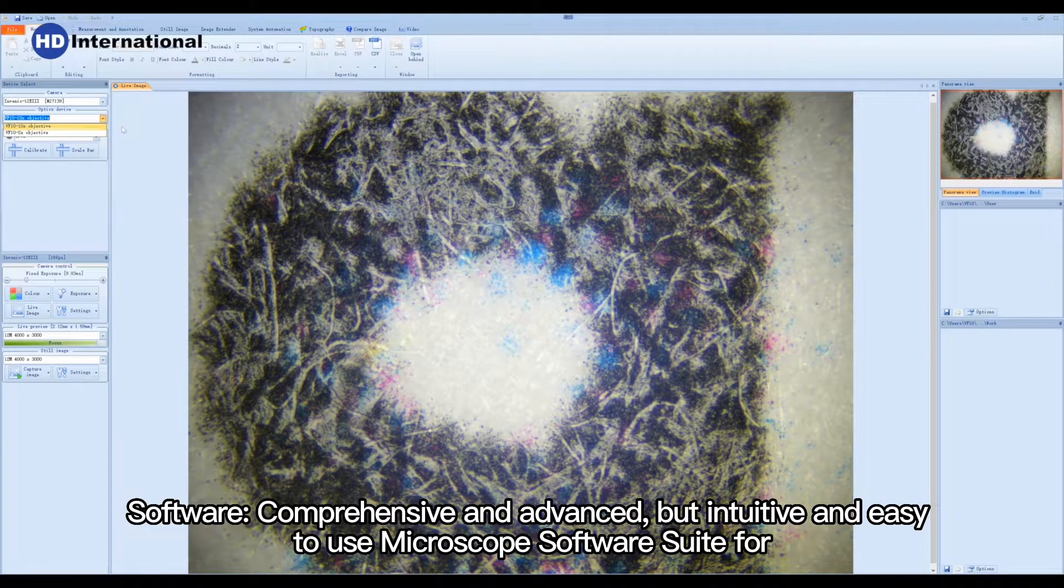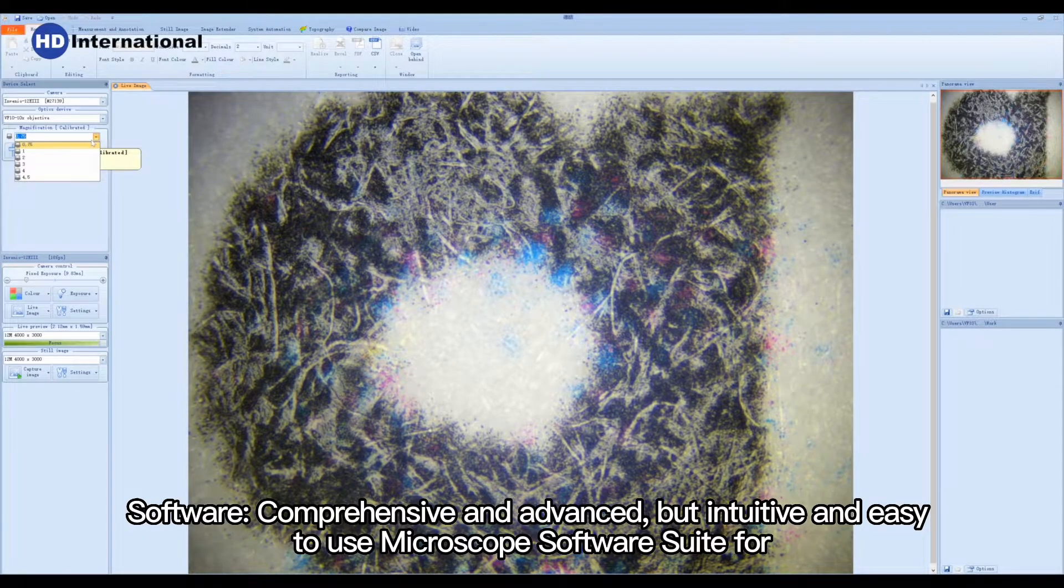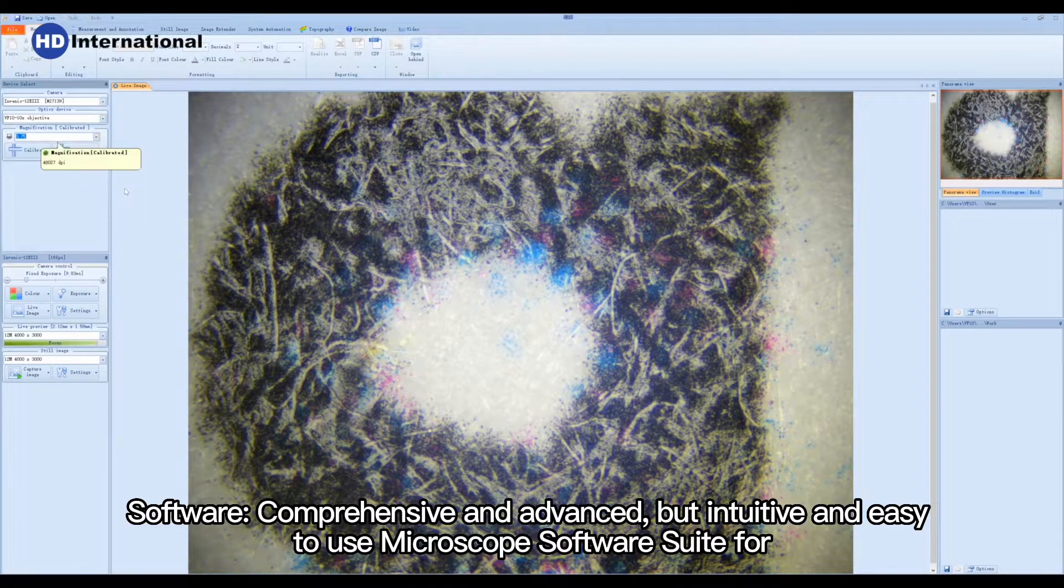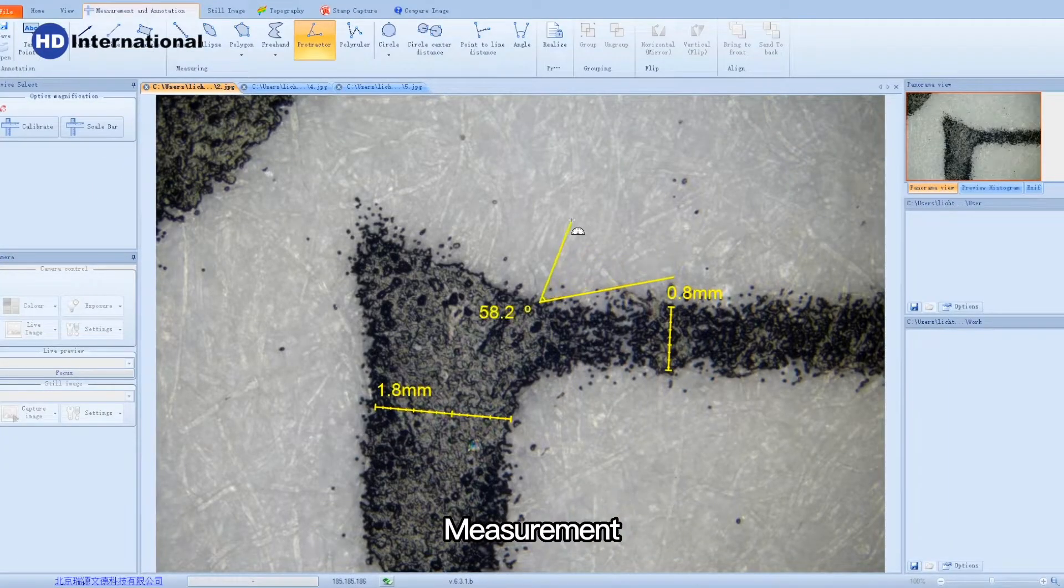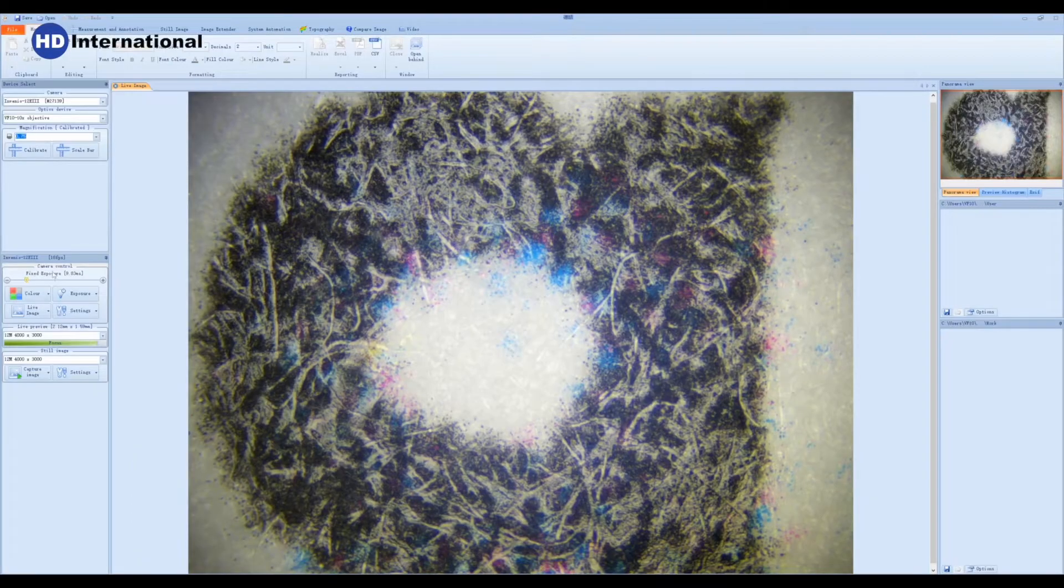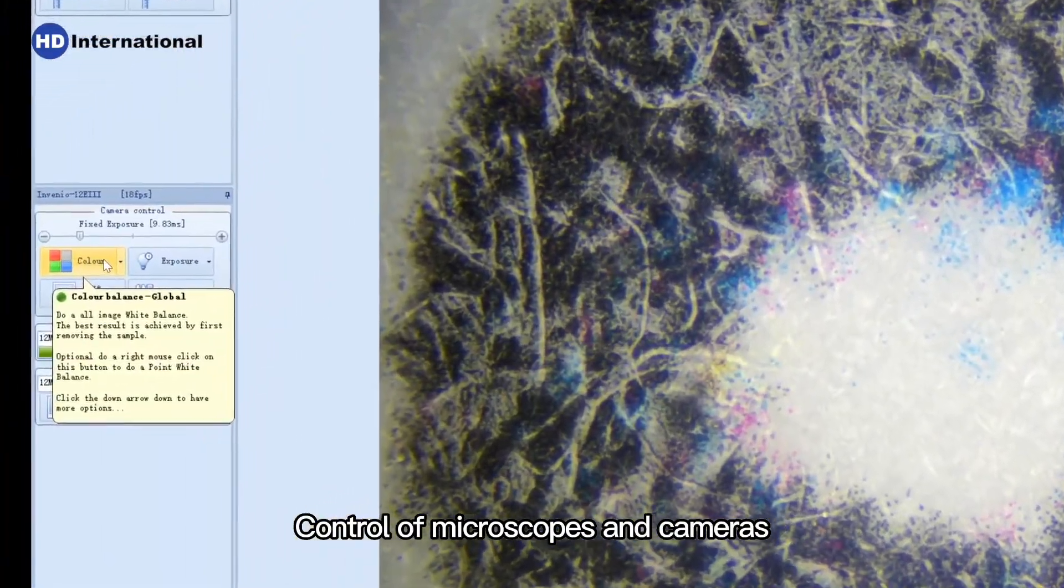The software is comprehensive and advanced, but intuitive and easy to use. The microscope software suite provides measurement capabilities and control of microscopes and cameras.